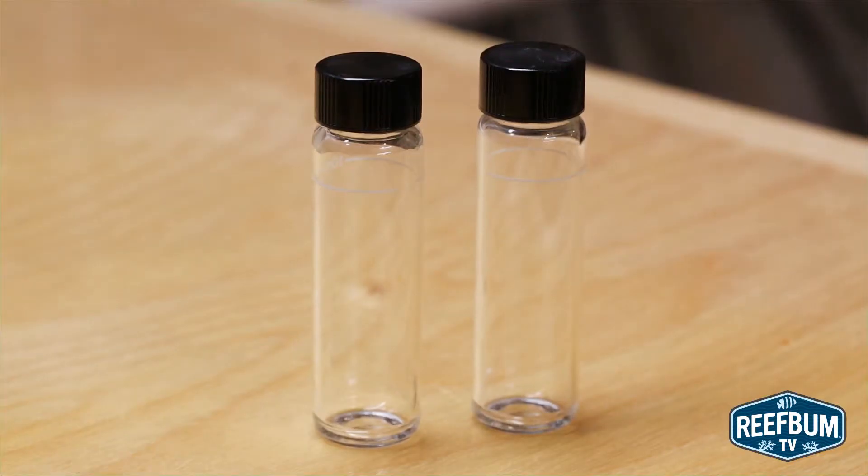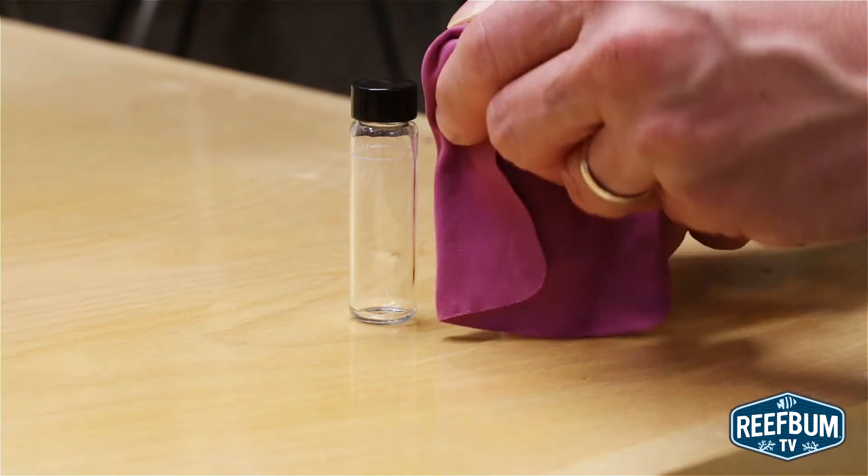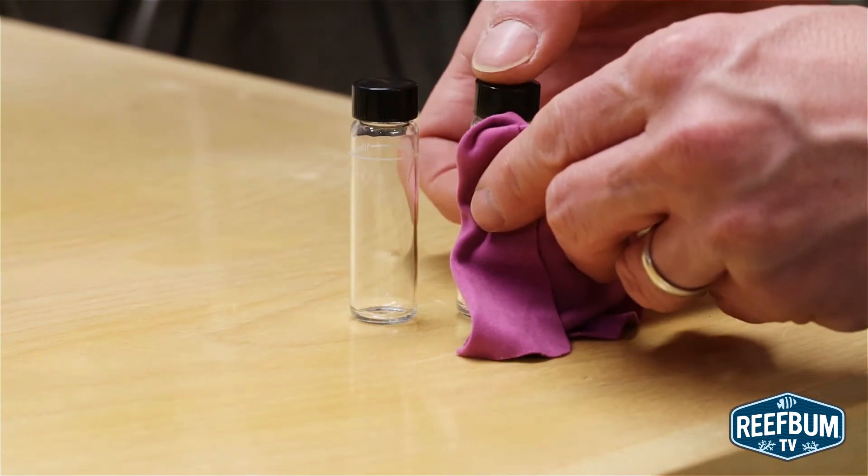First of all, make sure the water sample is free of debris and the vials do not have any water on the outside. The vials also need to be wiped down with a microfiber cloth, like the one you would use to clean eyeglasses, to make sure there are no fingerprints on the outside. You should also do the following.